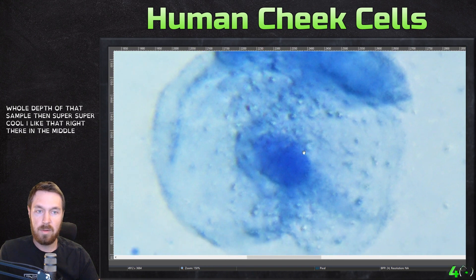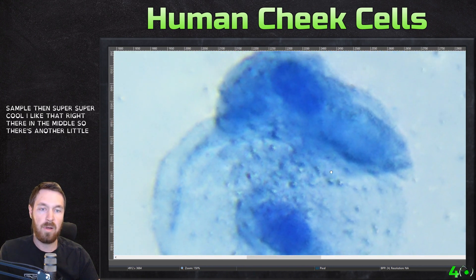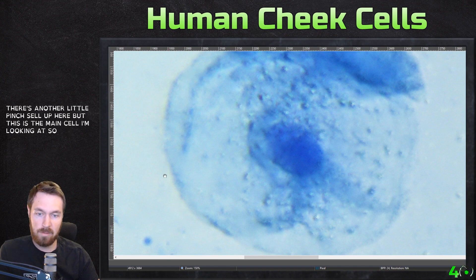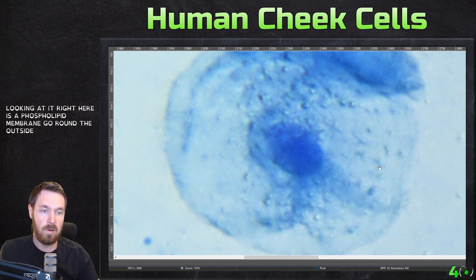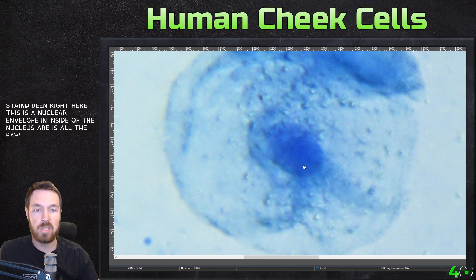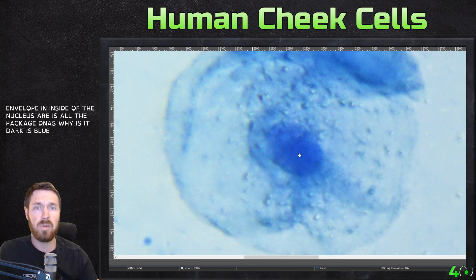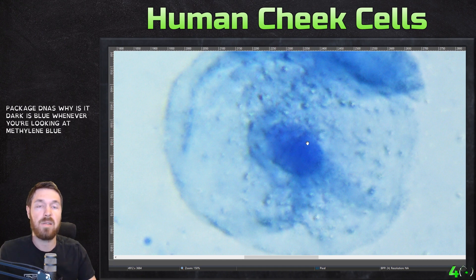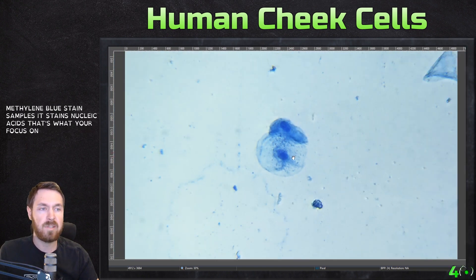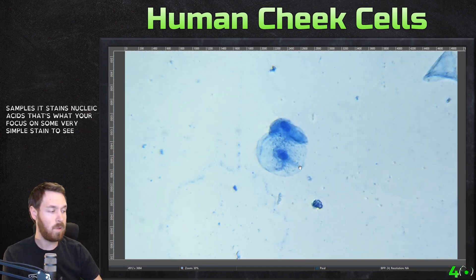So in this stacked image — right here in the middle is the main cell. Right here is the phospholipid membrane going around the outside, right here is the cytoplasm, some of these are probably little organelles or bacteria stained, then right here is the nuclear envelope, and inside is the nucleus with all the packaged DNA. That's why it's the darkest blue. Whenever you're looking at methylene blue stained samples, it stains nucleic acid — so that's what you're focused on. It's a very simple stain to see nucleic acids.